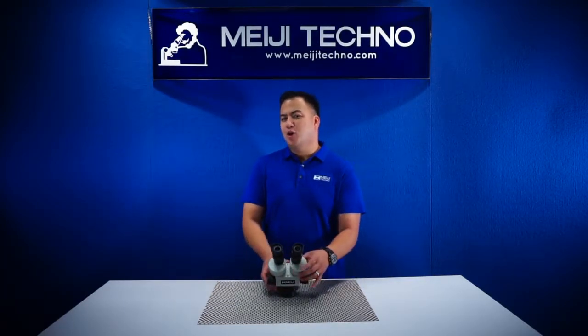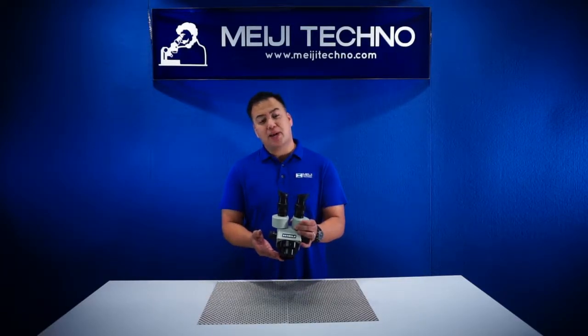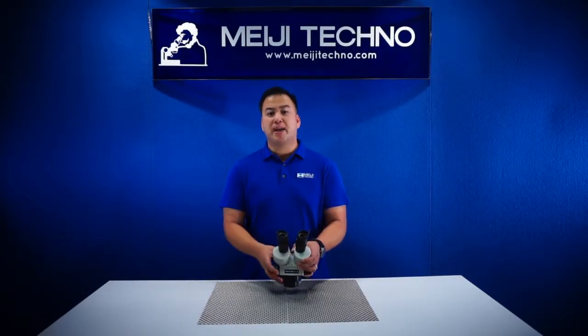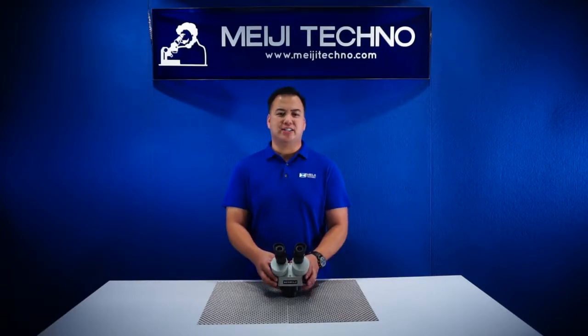The EMZ5 also has a range of optional eyepieces and auxiliary lenses that can be attached on the bottom, giving a magnification range from 2.1x to 270x.